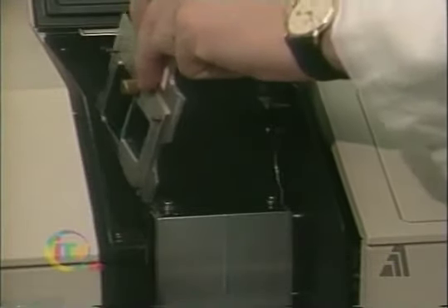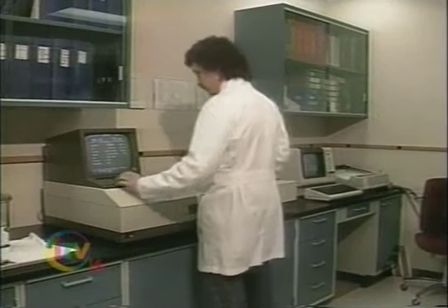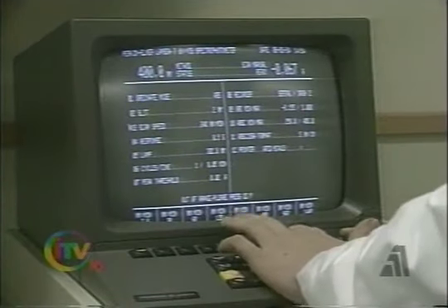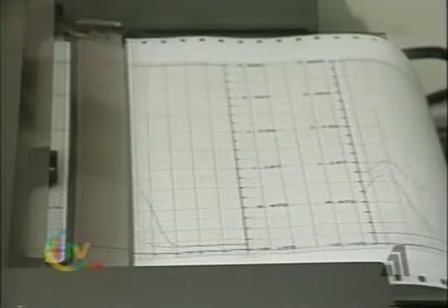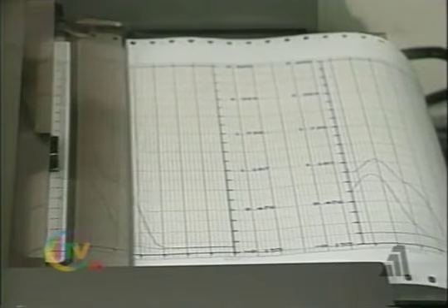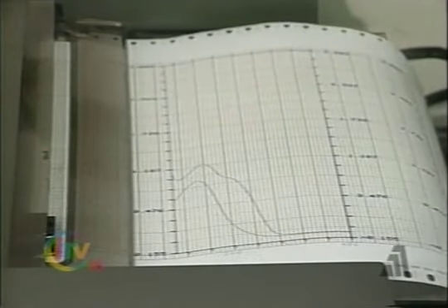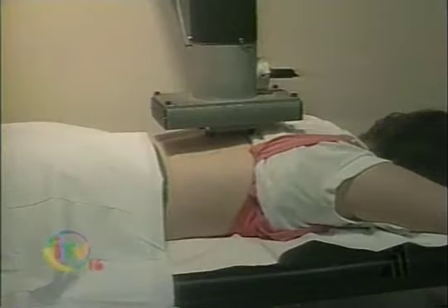The material is then placed in a spectroscope. The device sends ultraviolet radiation through the sunscreen layer and measures how much of it is absorbed by the molecules. With this information, Plough scientists can predict how effective those molecules will be in protecting skin.